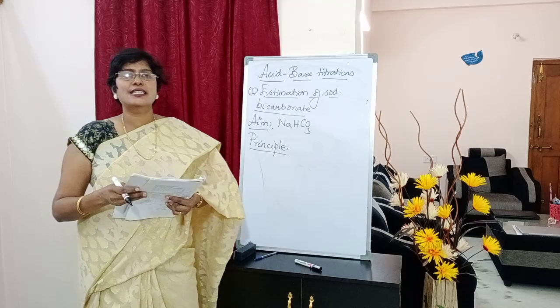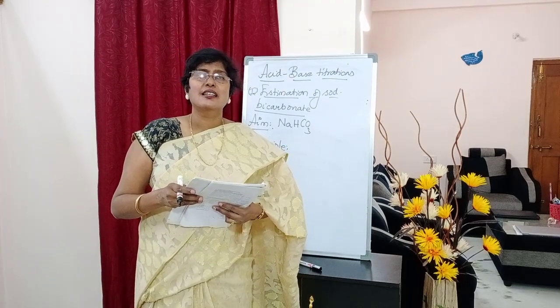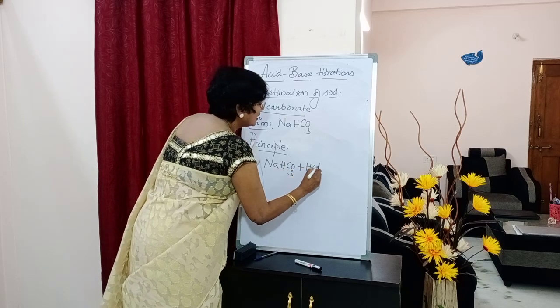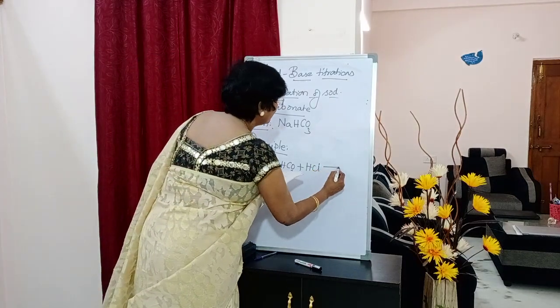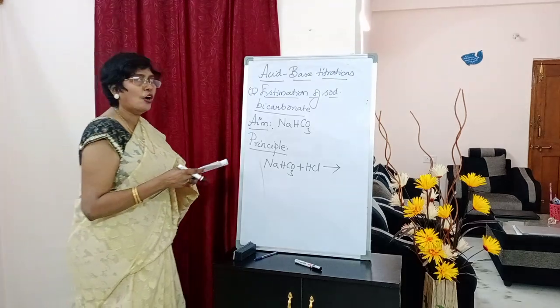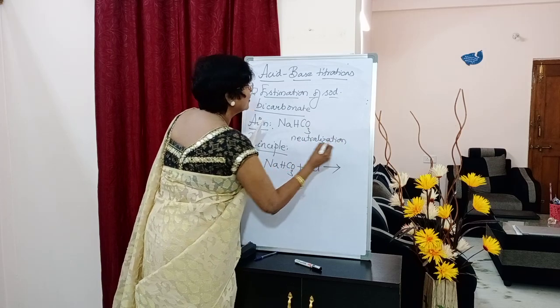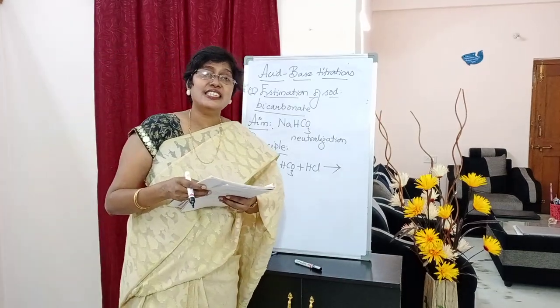Next side heading, principle. Write down: NaHCO3 reacts with HCl and the neutralization point can be detected by using methyl orange indicator. Look here students, I am writing the spelling.